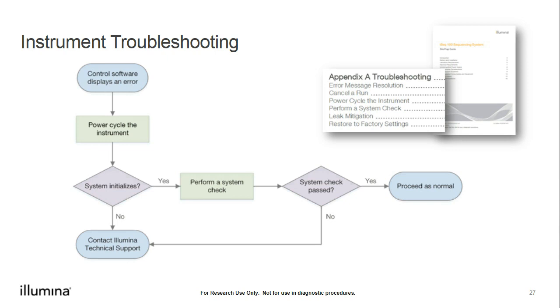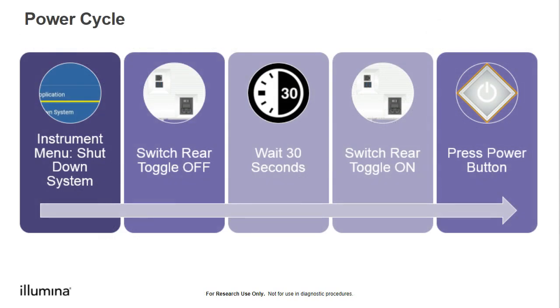And then that's the basics of the troubleshooting. So let's dive a little bit deeper into what that actual power cycle is. This is tech support's most common and generally most effective tool that we can use while doing some remote troubleshooting.